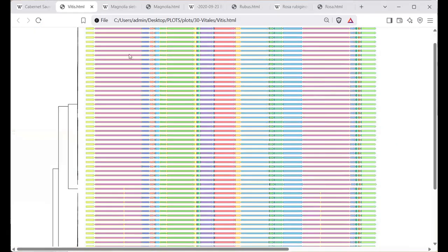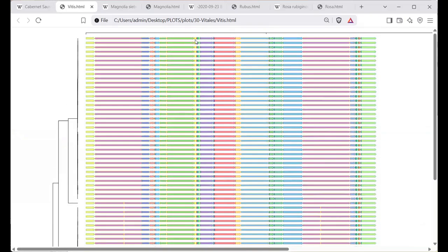Now, you also have to understand that each of these lines, or plastid sequences, is a circular sequence. So the plot shows it as a line, but the sequence of this green part is followed by the yellow part. If you remember the typical structure of a plastid sequence, it has a long single copy region, a short single copy region, and inverted repeats. On PGR-TK, the software allows me to click on each segment.